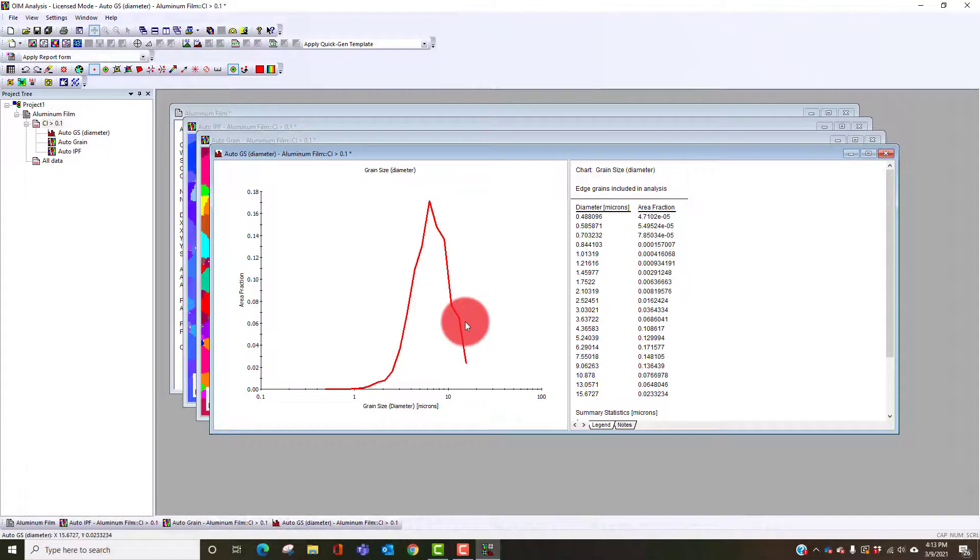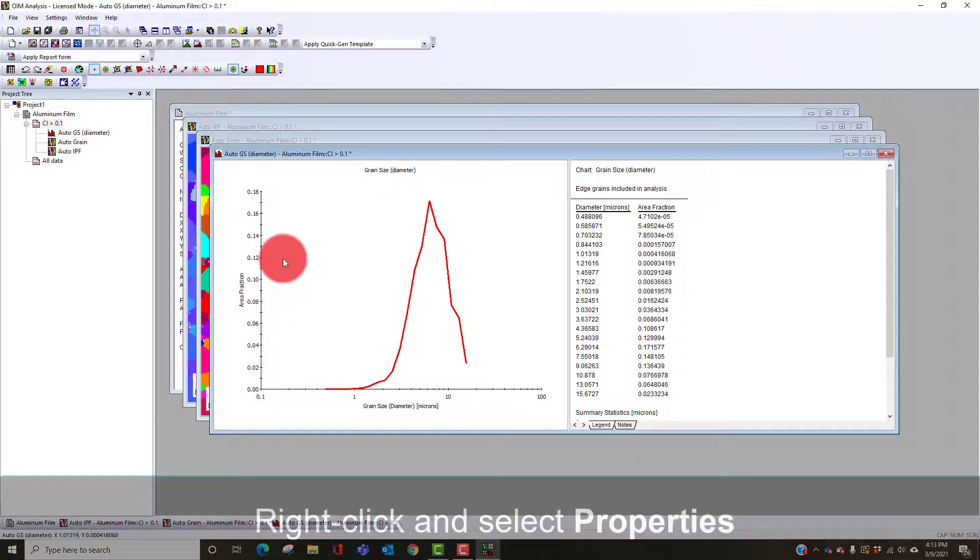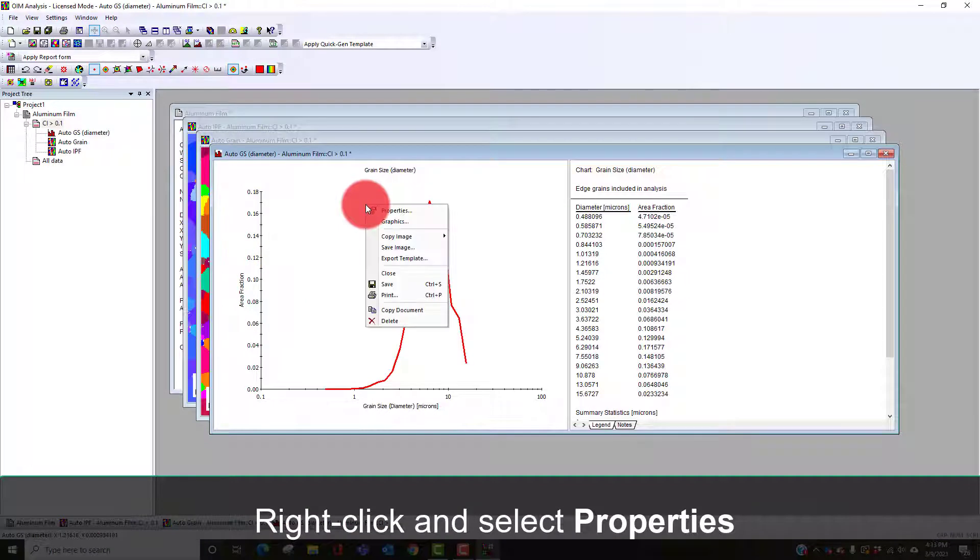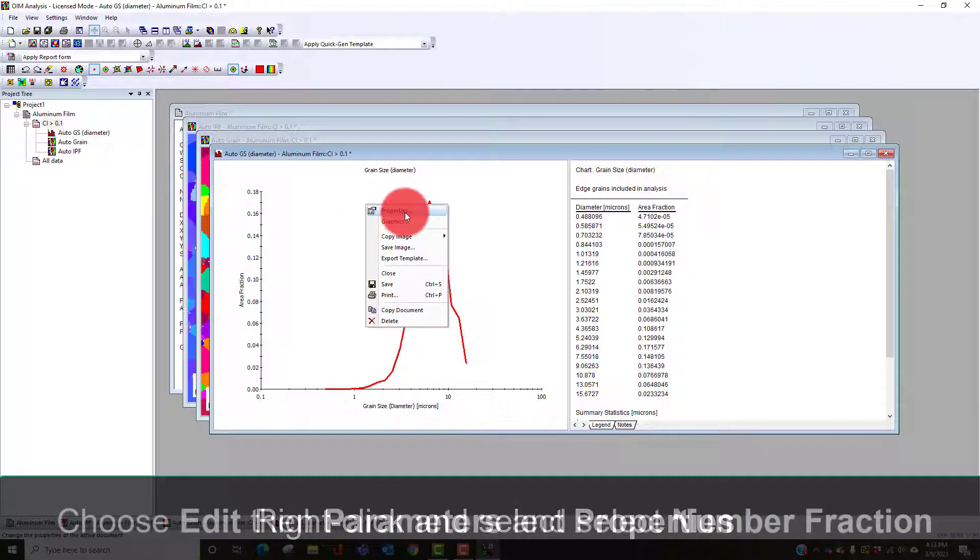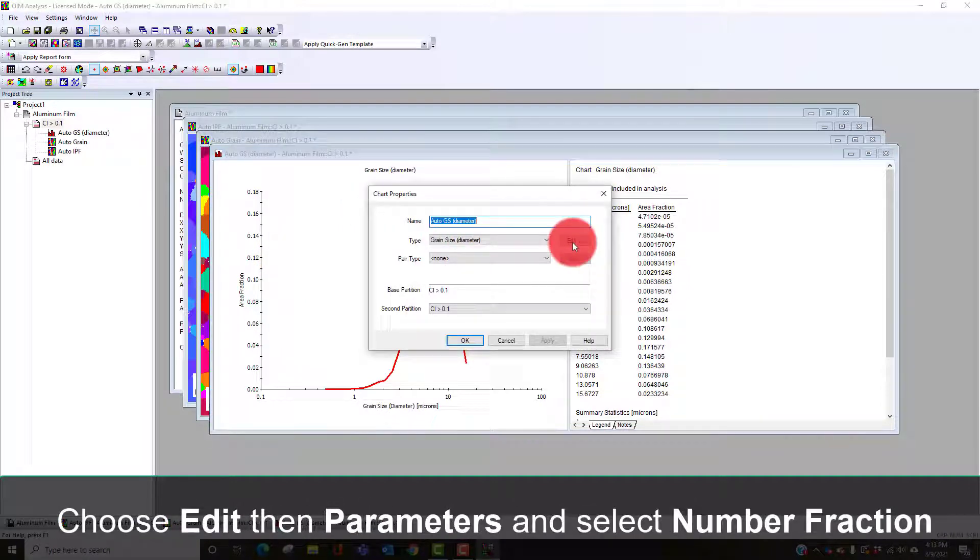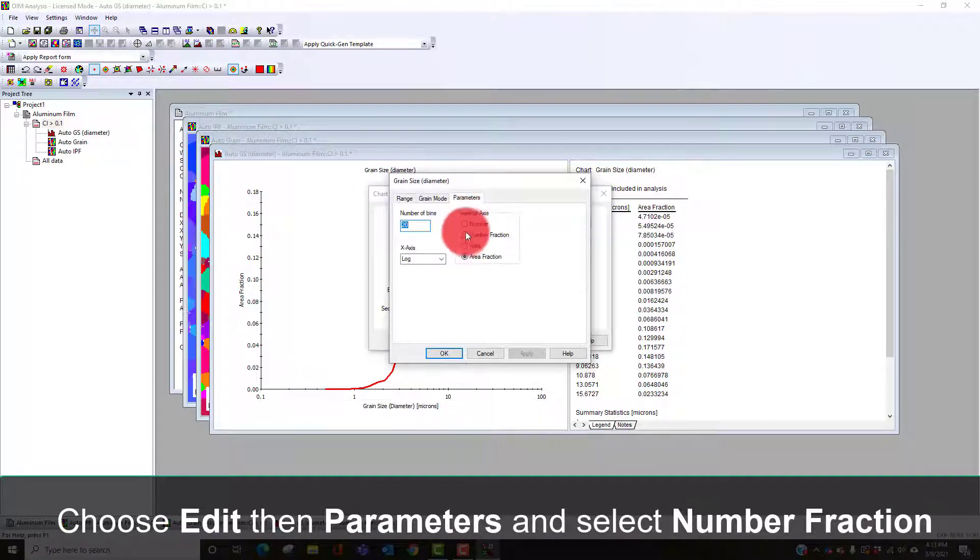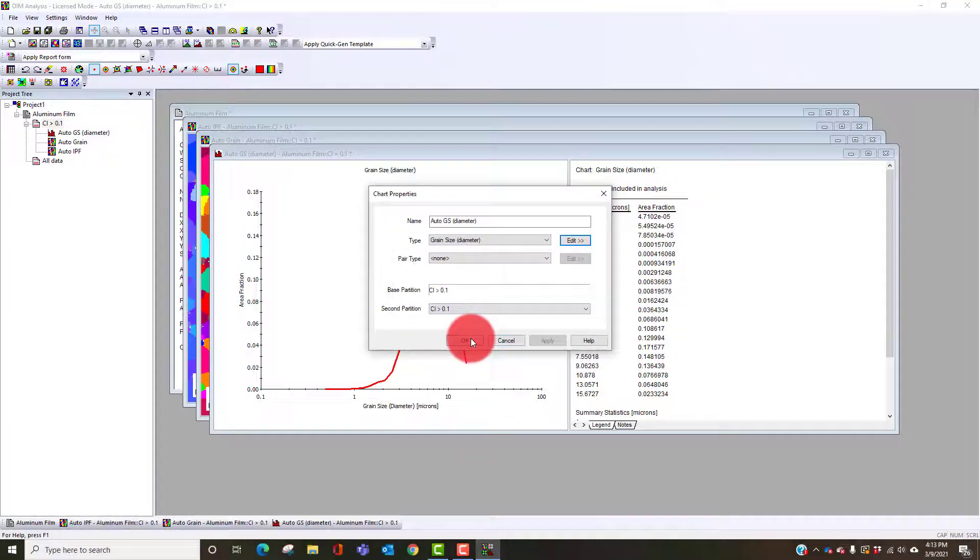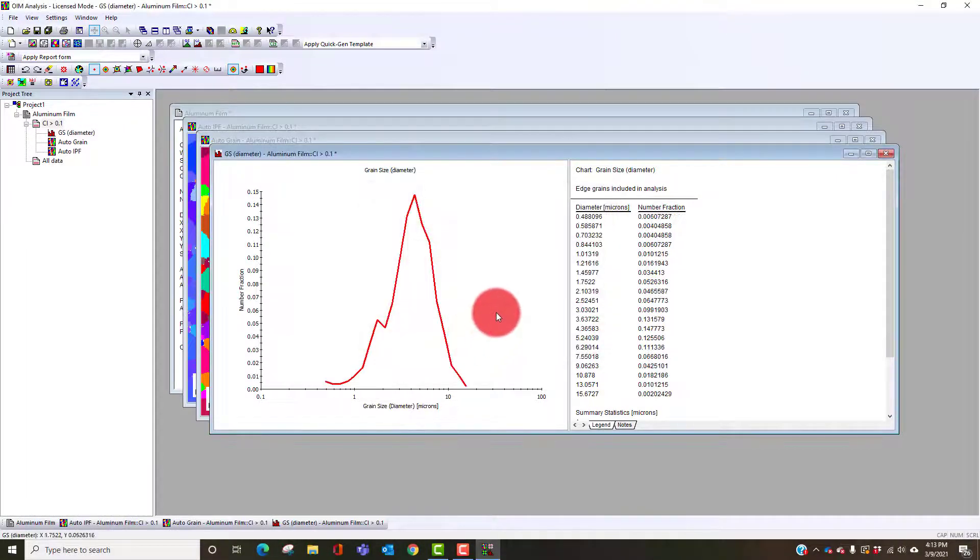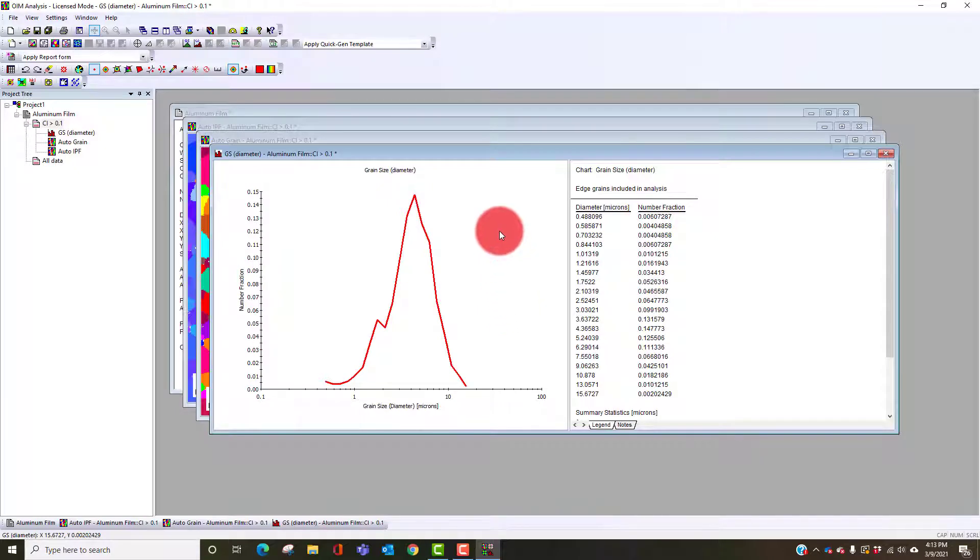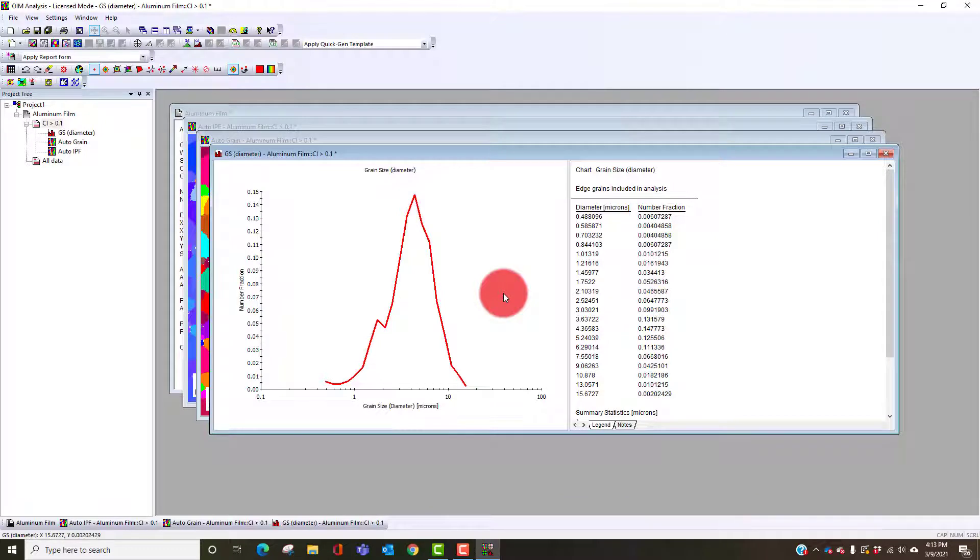In this case it's diameter versus area fraction. If I want a number fraction I can right click, go to properties, edit parameters and go to number fraction. This is more generally what we think of in terms of a numerical average where we're adding up all the sizes and dividing by the number of grains. You can see here a pretty nice distribution with good sampling.